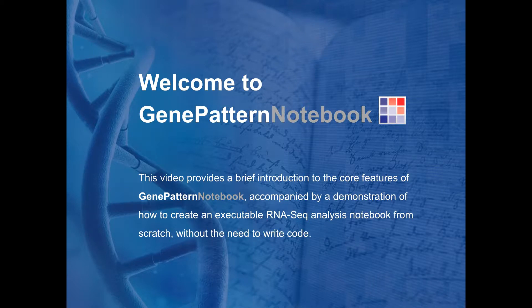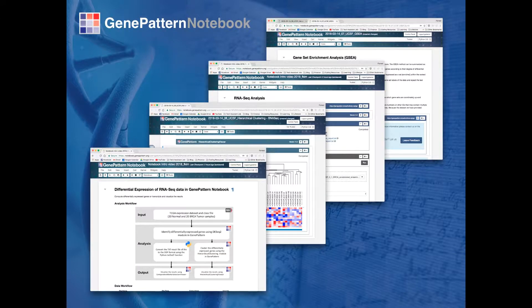The GenePattern notebook environment allows researchers to create complete research narratives combining text, images, multimedia, and executable analyses without the need to write code. The result is a single document containing both the scientific exposition and the associated analysis which can be published, shared, and easily adopted.